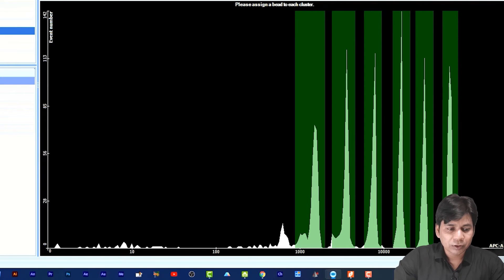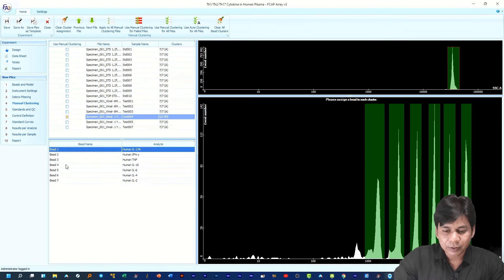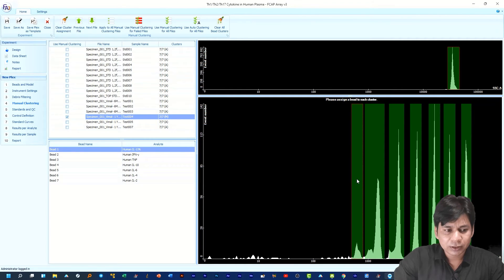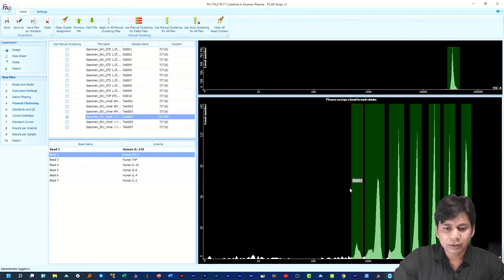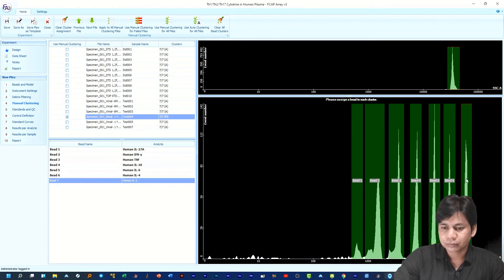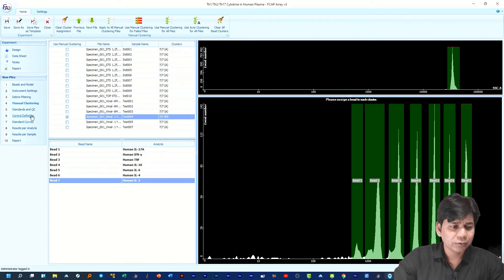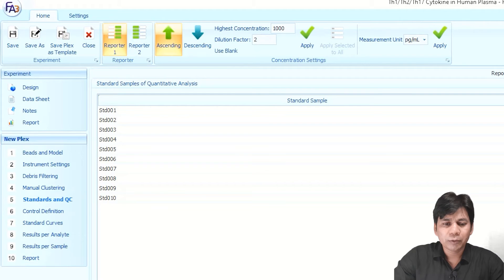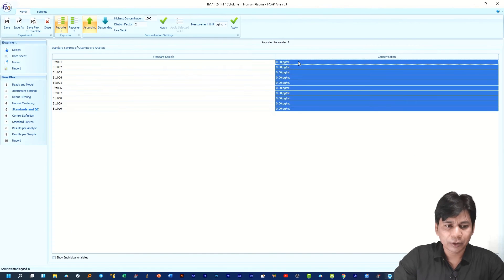You have to select Bead 1 and then select Cluster 1, and double-click on it. You can see Bead 1 is now assigned. Like this you have to assign all the remaining clusters for this sample. Next, click on 'Standard' — here you have to enter the standard concentration values manually or by selecting the highest concentration.